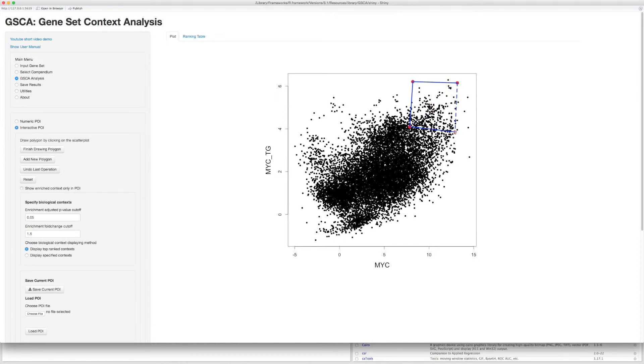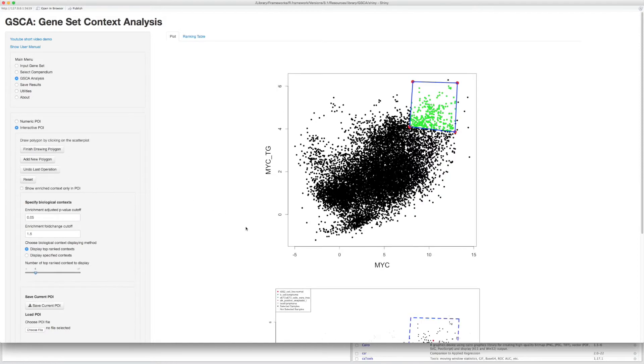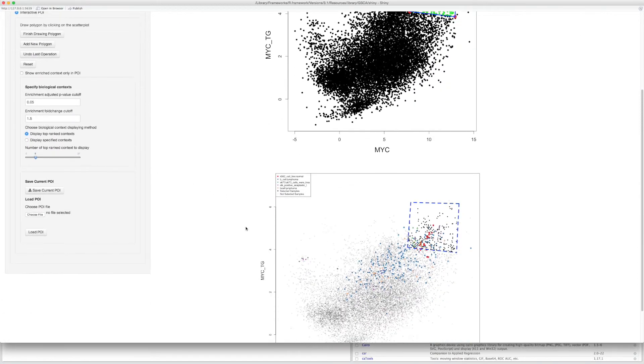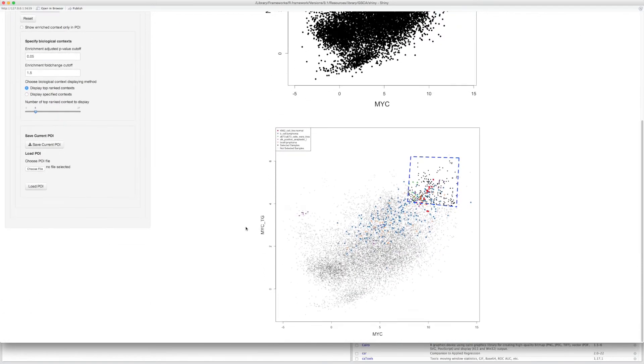After you have finished, click Finish Drawing Polygon button. And GSCA will return the enriched biological context associated with this particular POI.